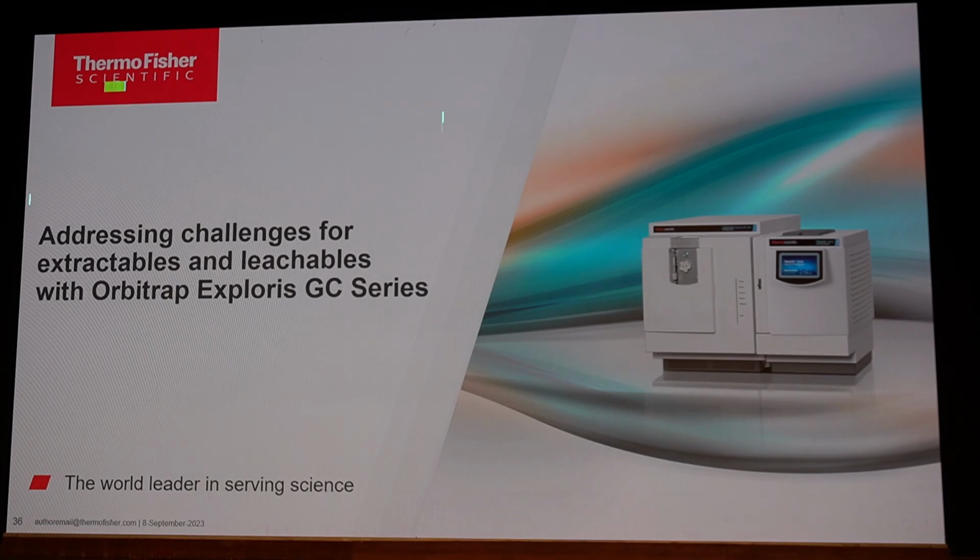Then the other major issue in pharma is extractables and leachables.